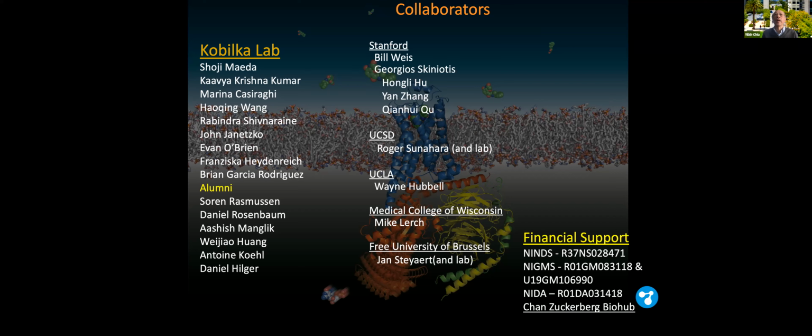Great. And there's a question from Dr. Ganjand. The question is that they are working on another protein called the adenosine A2A receptor, and they are trying to solve its dimeric structure. The full length of the single polypeptide is 40 kilodaltons, so the dimer is 80 kilodaltons. So what's your opinion about the prospect of solving this structure using cryo-EM?